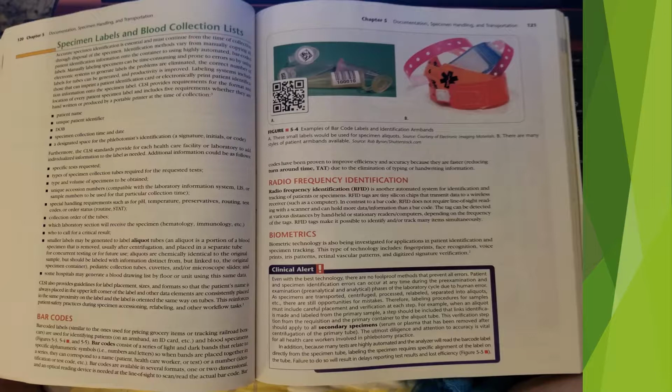So when bands are placed together in a series, they can correspond to a name, patient, healthcare worker or test, or a number, identification or test code, etc. Barcodes are available in several formats, one or two-dimensional, and an optical reading device is needed at the line of sight to read the actual barcode. Barcodes have been proven to improve efficiency and accuracy because they are faster, reducing turnaround time due to the elimination of typing or handwriting information.